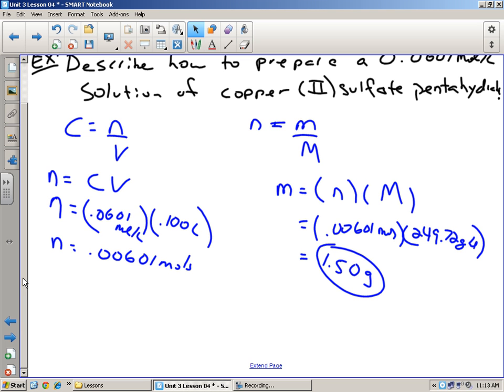Just keep in mind that when you do this, water's still coming out of here and still draining down as you're watching it go. So when you stop, water's still going to come out and down, and you're going to overshoot it, because it takes a little while for the water to get down.